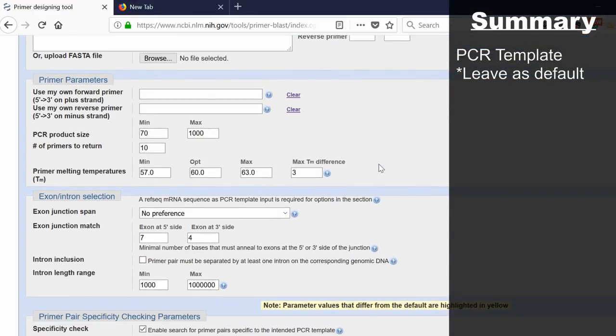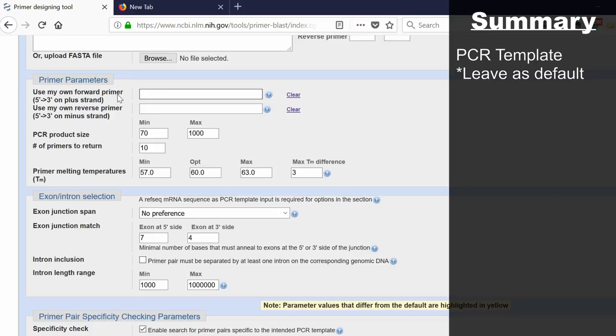Next is the primer parameters. At the top, you can use your own forward and reverse primer. If you inputted your own sequence of primer here, it will find this for you on the results. But because we're designing new primers, we want to leave these blank.